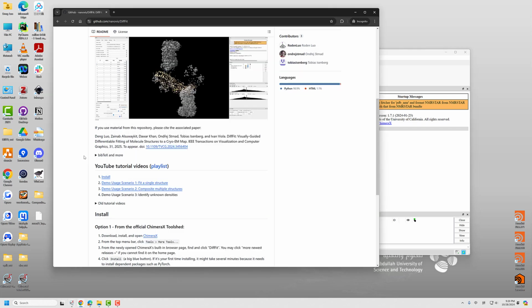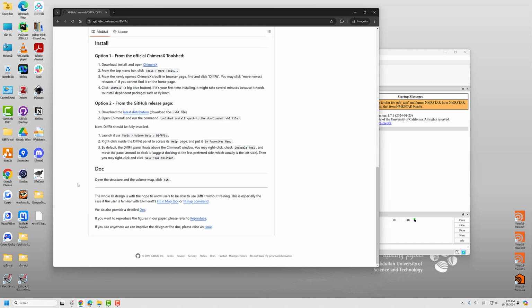Hi, this video is to show the DiffFit demo usage scenario 3: identify unknown densities from a library of many structures. We will follow the documentation here.